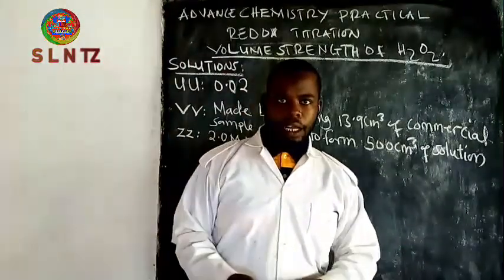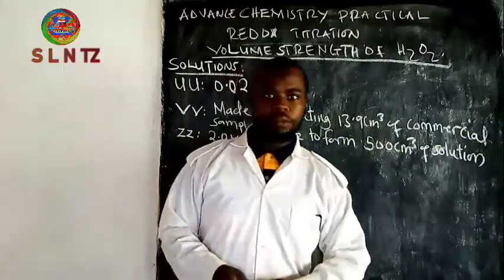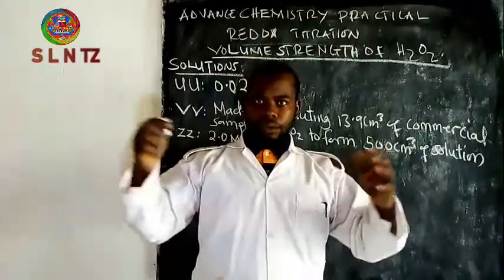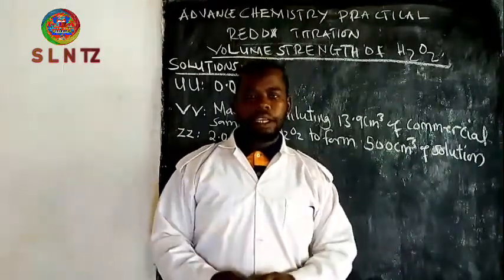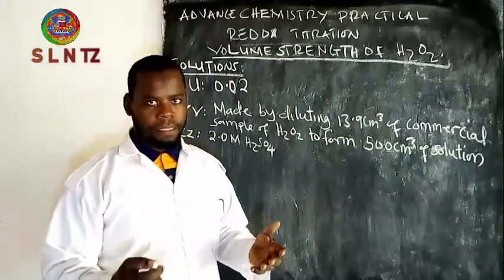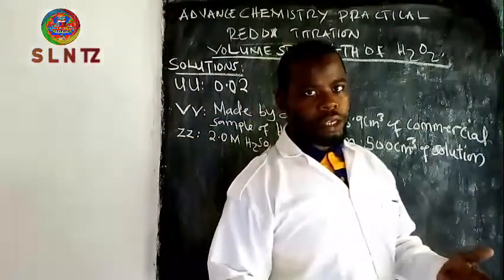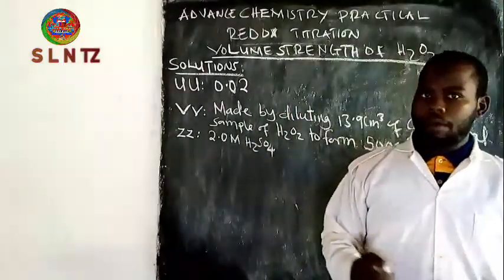Just give your time to this lesson and make sure you contribute, in order to have a full understanding of today's lesson. Today we have chemistry practical, advanced practicals of chemistry, and we are continuing with our lesson.